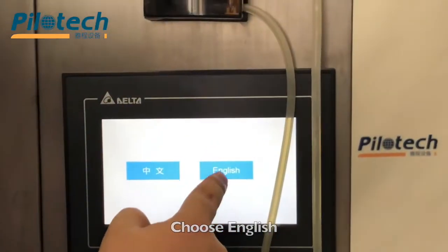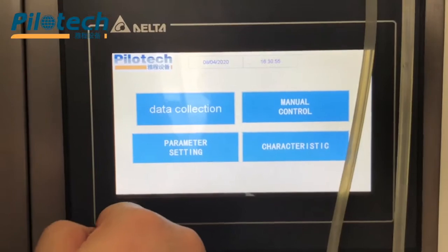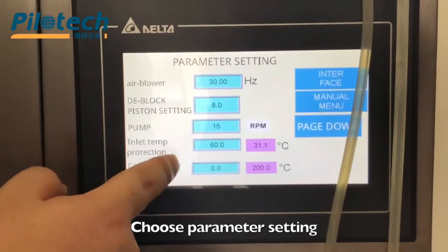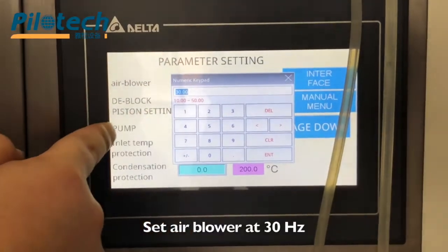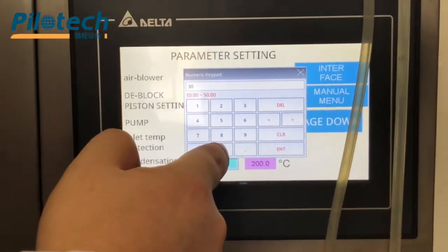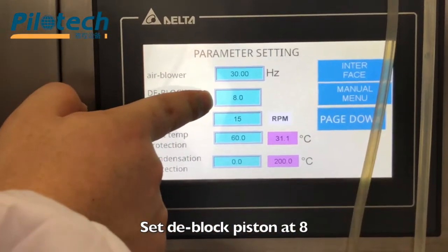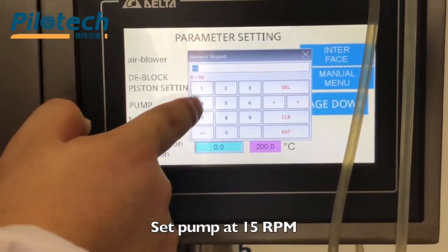Choose English and click anywhere on the screen. Choose parameter setting. Set air blower at 30 Hz. Set D-block piston at 8 Hz. Set pump at 15 rpm.